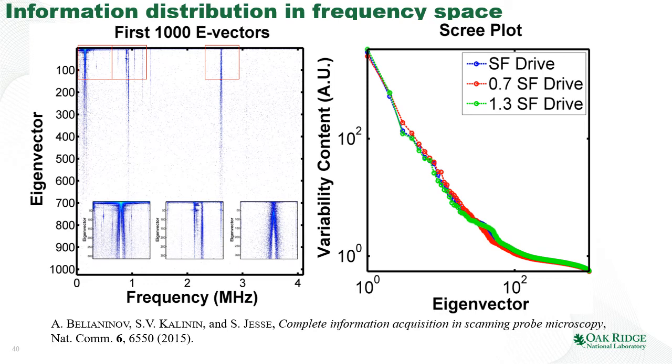And you can see that in the tapping mode measurements, the information is actually concentrated in a pretty large number of these eigenvectors, of the order of several hundreds. And that basically means that the interaction between the tip and surface is strongly nonlinear.